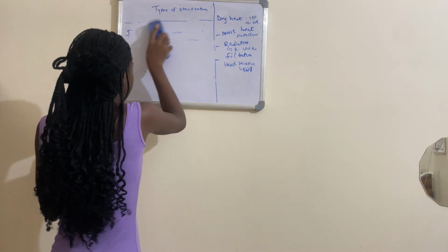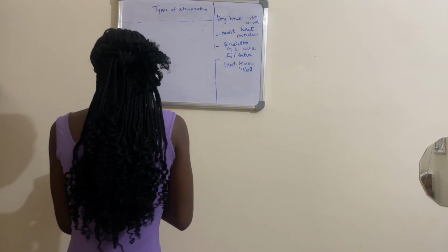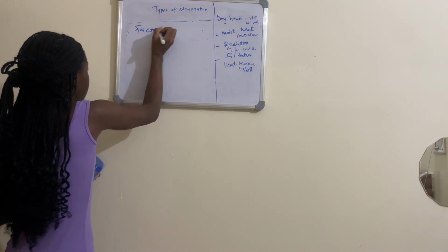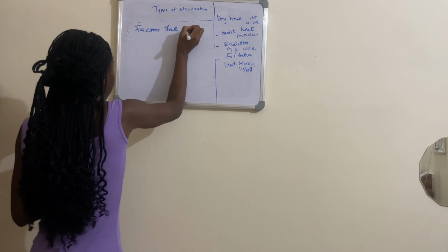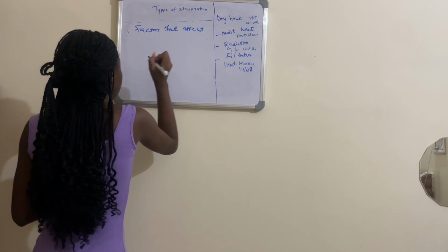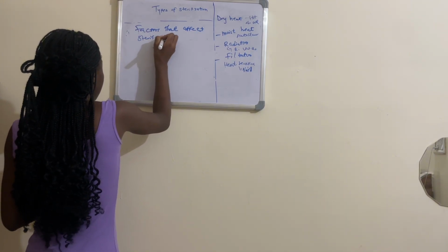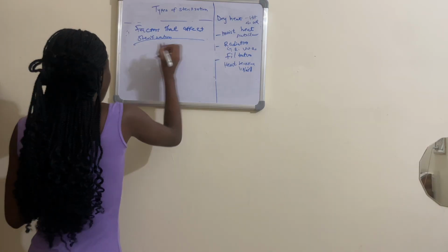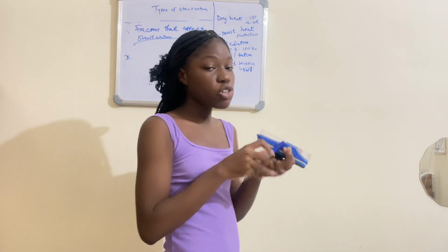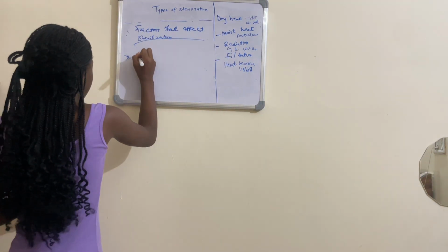Factors affecting sterilization. This is important, guys. One of the first factors that affects sterilization is the temperature. The temperature at which sterilization is performed actually affects sterilization.